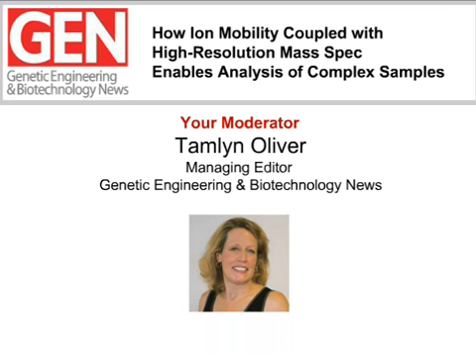If you want to know more about IMMS, Ion Mobility Mass Spectrometry, in case you didn't know, you're in the right place. Our three speakers today will describe recent advances in IMMS measurement strategies in the analysis of complex biological samples in systems biology, proteomics, and protein characterization. They'll also talk about bioinformatic and biostatistic solutions to quickly mine the data collected. As you've probably surmised, they have a lot of material to cover, so I won't waste any time in introducing them and getting this webinar started.